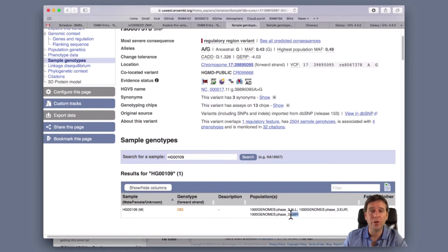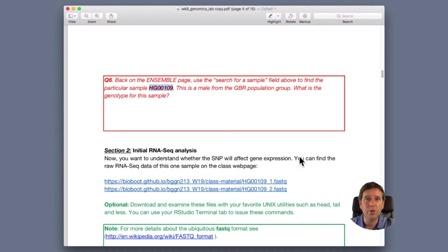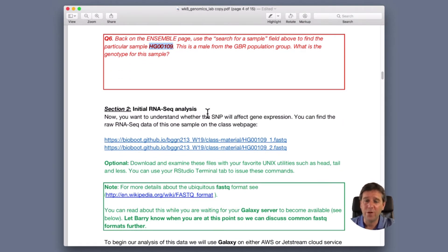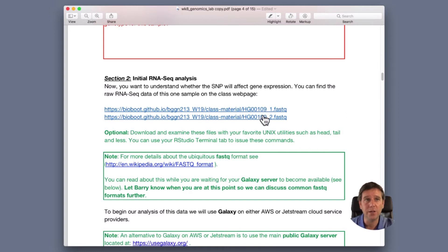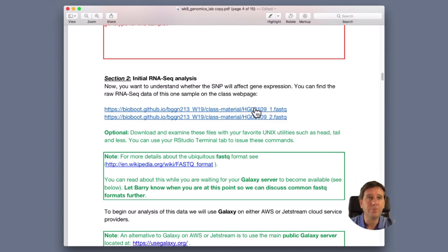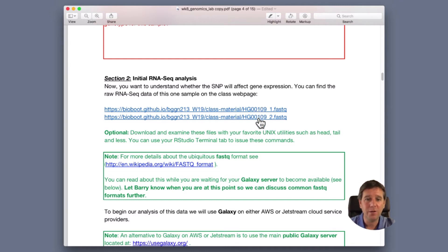This is a person from that British population - the one with twice the frequency than the previous population. In section two, what we start to do is understand whether the SNP will affect gene expression. We can go to the 1000 Genome Project page and if you have permissions, start downloading data for these individuals. I've taken the liberty of doing that to make things easier. On our class website there are links to sequencing data - FASTQ files from the sequencer. This was Illumina sequencing, paired-end, as we discussed in our videos. There's FASTQ1 and FASTQ2 - the two files associated with paired-end sequencing. I'm going to click on them to download them.